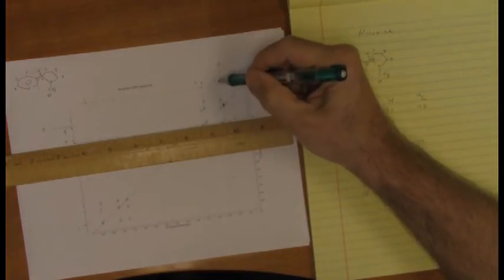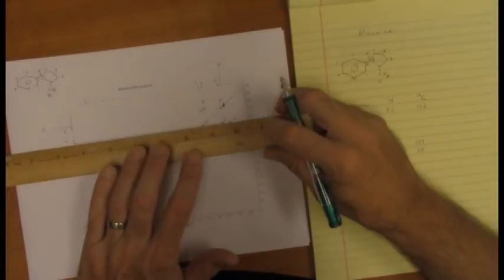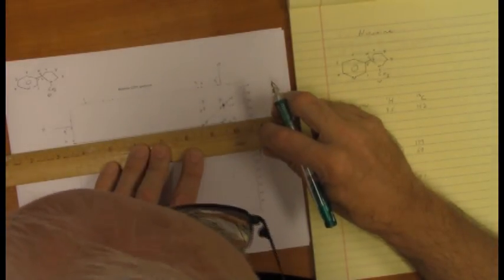But you look at it carefully. Notice how I've labeled it. That is 9 prime. It's no great surprise that one of the protons on carbon 9 is coupled to the other proton on carbon 9. It's a 2-bond coupling. They're only 2 bonds away from each other. Sometimes it would be referred to as a geminal coupling. But that one I already knew about, so that one's kind of irrelevant.